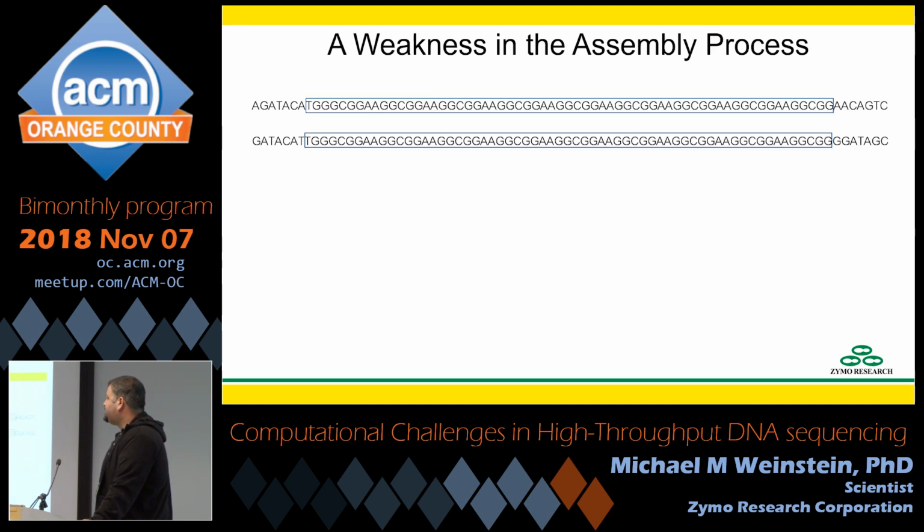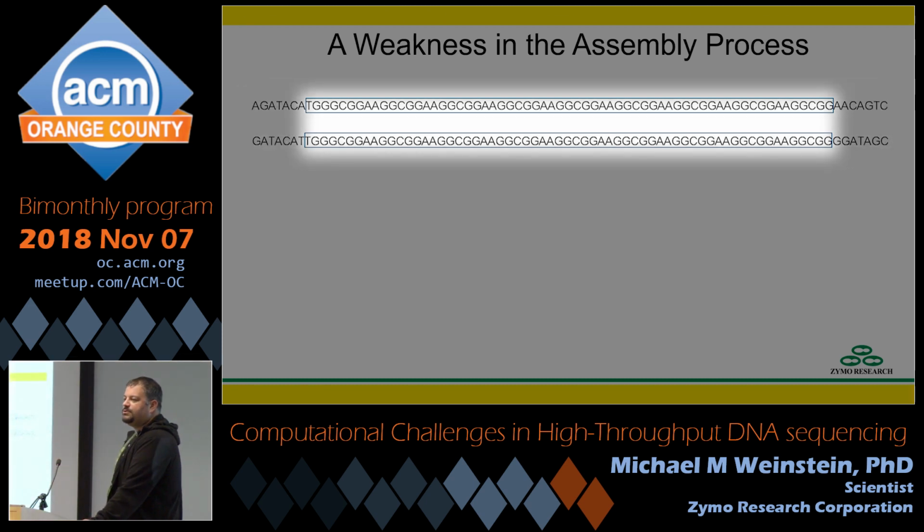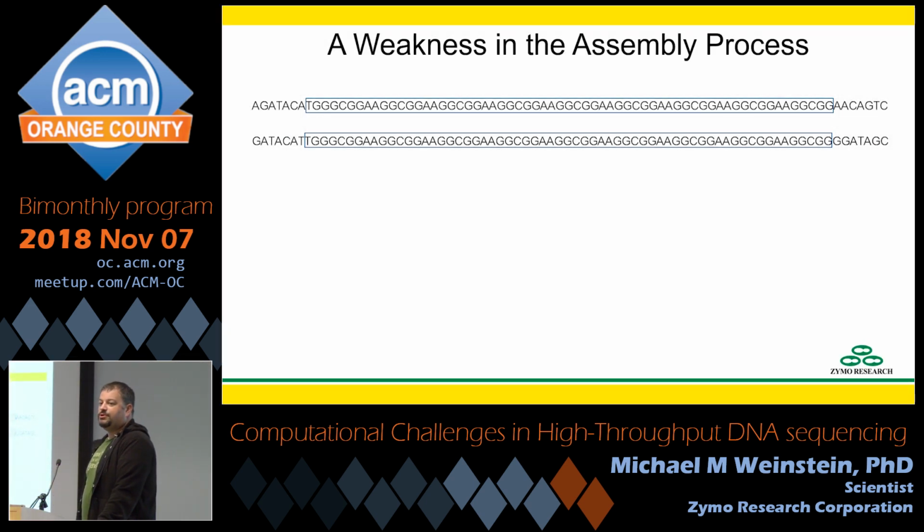Something that gets even nastier is when we have two different sequences, but both of them have a stretch that's identical in the middle. Do we have a lot of this kind of scenario in the human genome? We have a ton of it. We have things called ALU repeats, which I believe are just old viruses that integrated and are scattered throughout our genome. LINE and SINE elements too, all these repetitive elements just scattered.